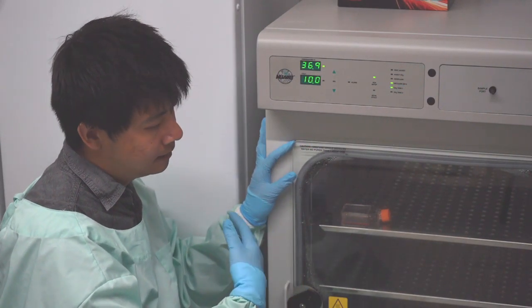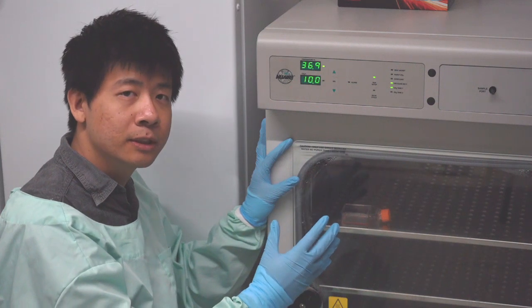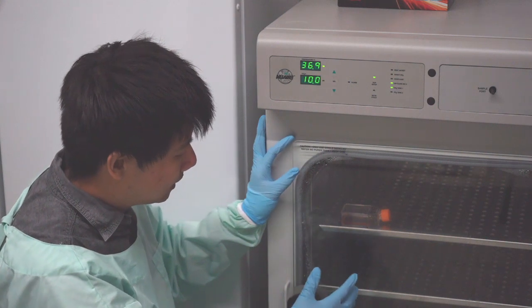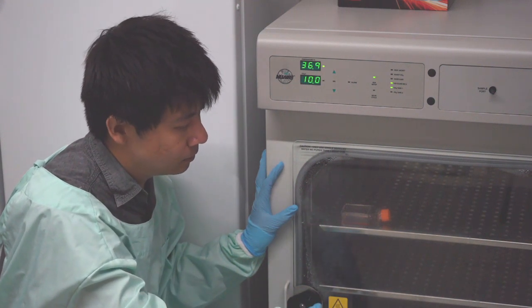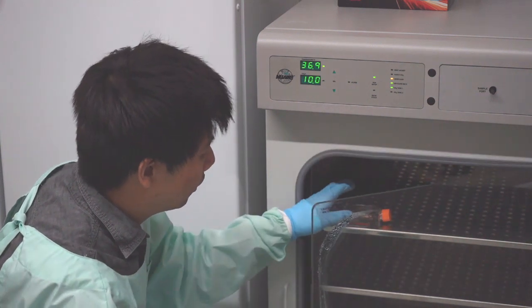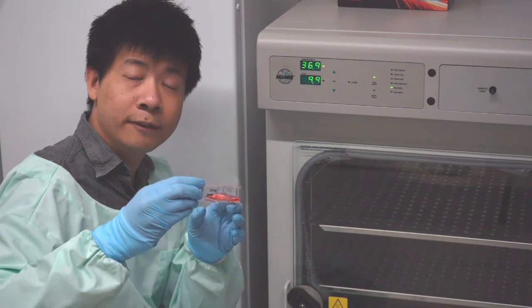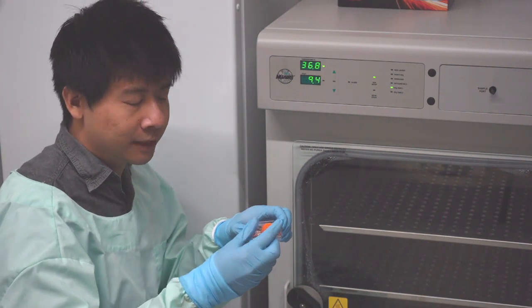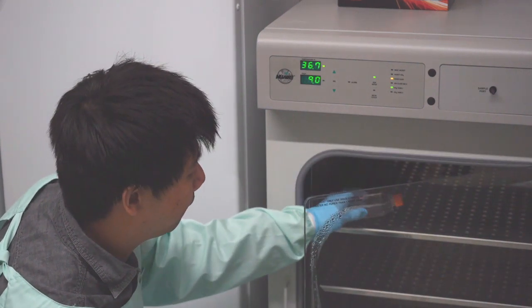The interior needs to be humidified to ensure that the cell culture media within does not evaporate. This is achieved by a water bath at the bottom that keeps the interior humidified. Inside we have a cell culture flask where the cells live. We try to keep the flask at 37 degrees as much as possible so that we don't affect cell growth. When I open the chamber, you can see the carbon dioxide levels and the temperature begin to drop, highlighting the importance of keeping both windows closed and having a dual-chambered, double-insulated system.